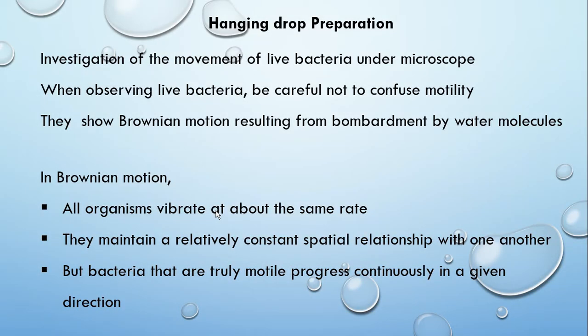Hanging drop preparation. Investigation of the movement of live bacteria under the microscope is done by preparing a hanging drop. When observing live bacteria, be careful not to confuse motility with Brownian motion resulting from bombardment by water molecules.